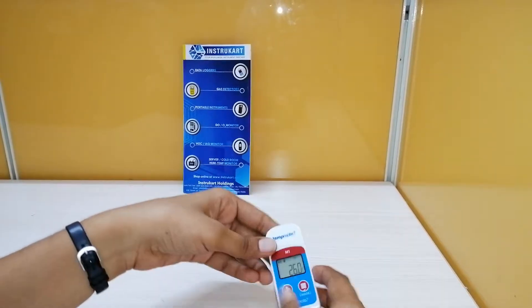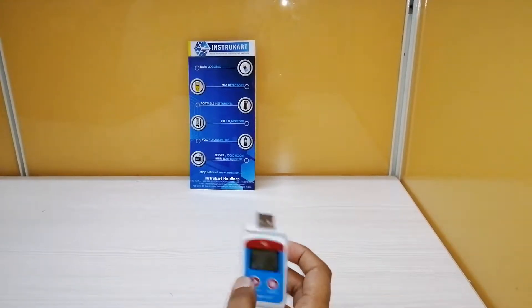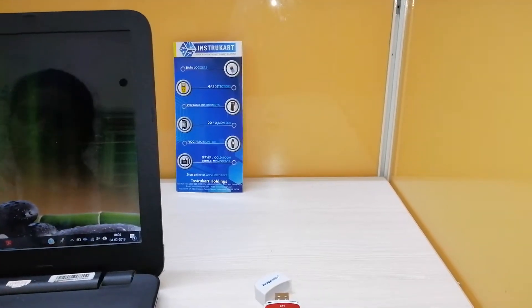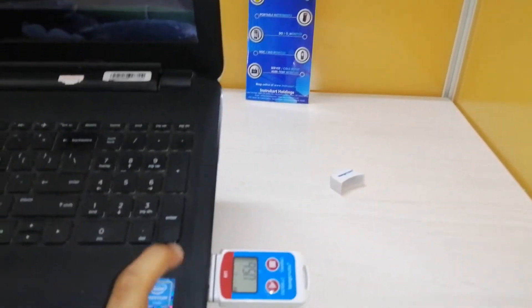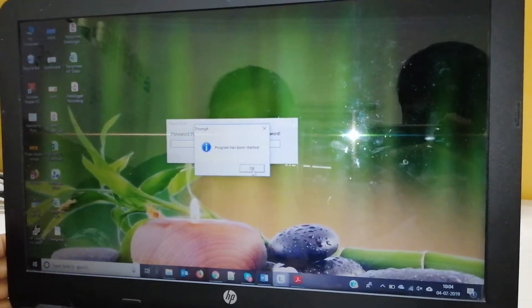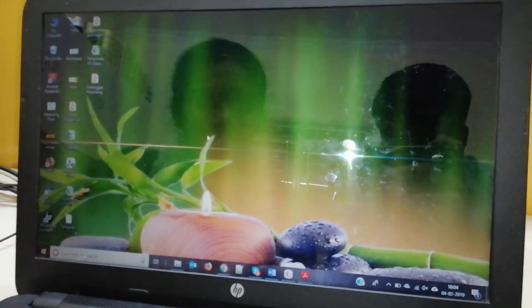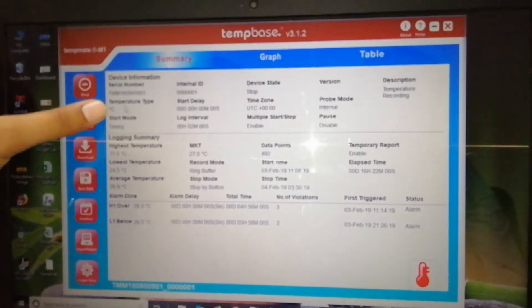This is the cap provided for protection of the USB. This data logger has many other parameters which can be set using the software. This is the software used for this temperature data logger. When it is connected to the PC it shows the USB connection, and it is password protected.